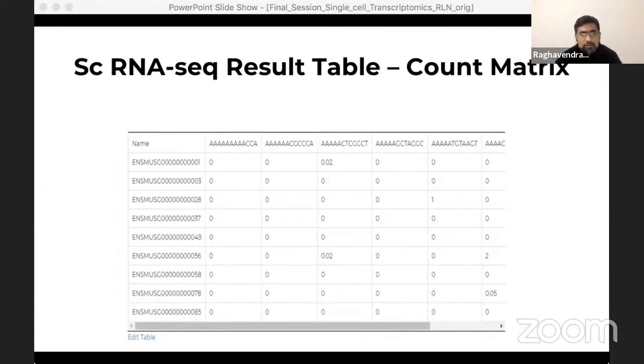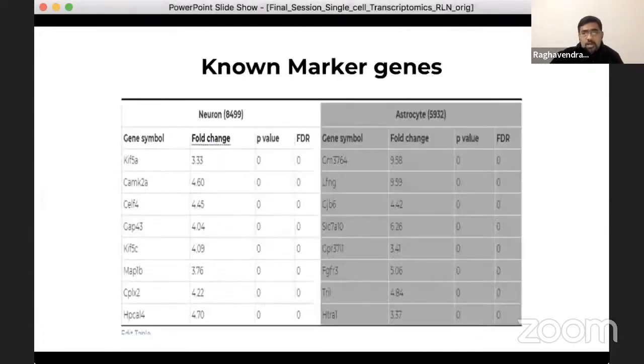This particular data is used to identify the different classes of cells in murine amygdala tissue, and thus we will use known molecular marker genes to understand which cell types are present in the table that was just generated from the upstream analysis of unstructured data to structured data. So we now subset only those genes that are known to be markers of different cell types, and we generate a smaller table from this larger table.